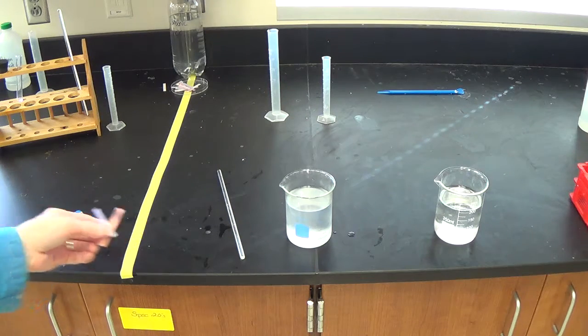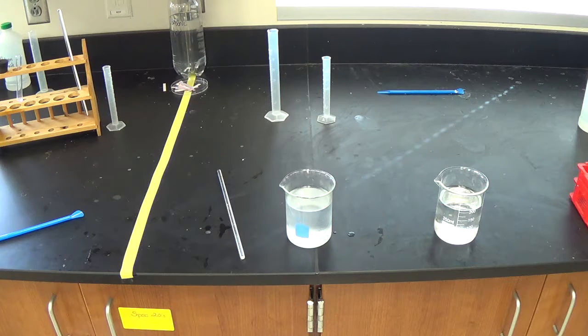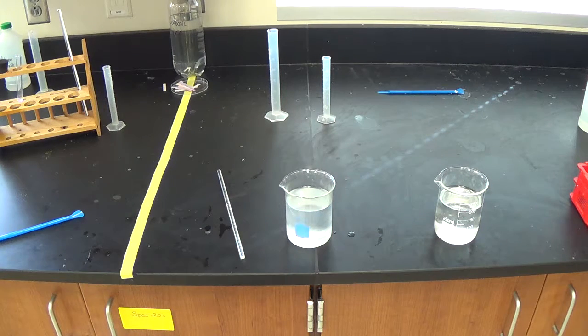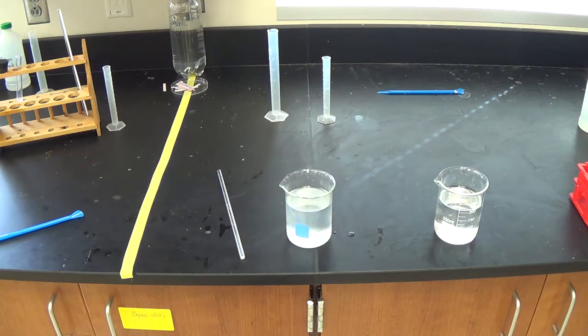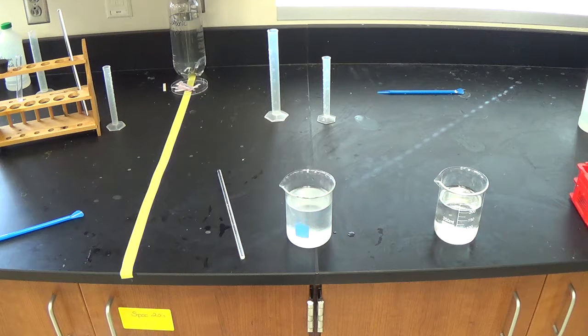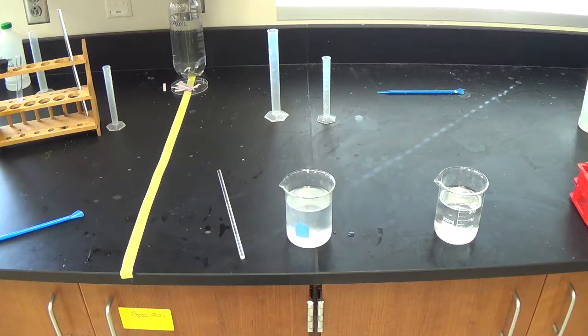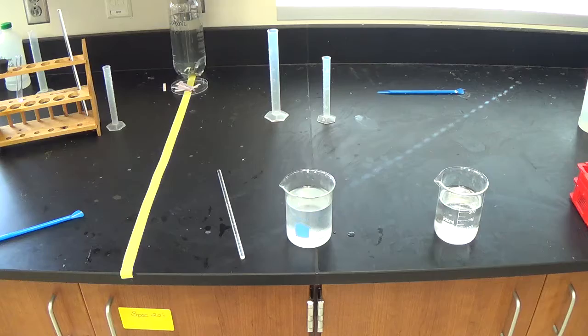Along with forming a gas that moved the sodium around the beaker, it formed a base. As you go through and predict and balance that reaction, be sure your products are one of them's a gas and one of them's got to be a base. It's a way to show on paper that what happened in real life has the real consequences that we show on paper.